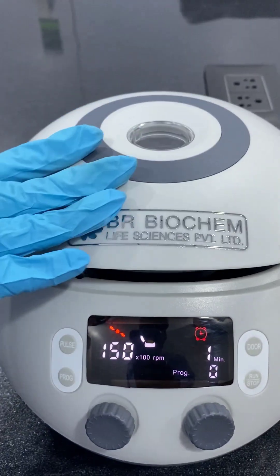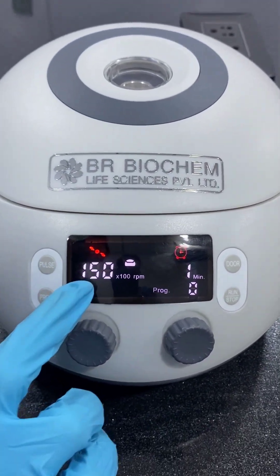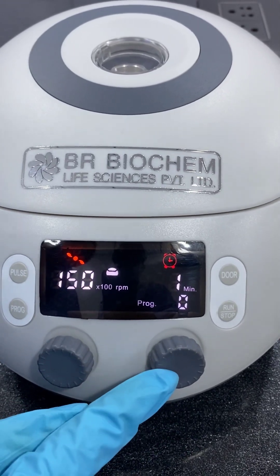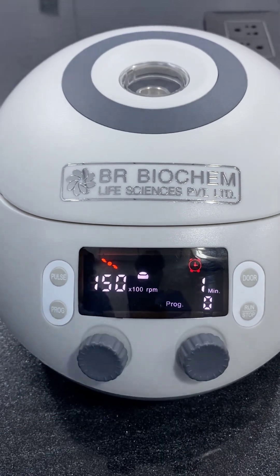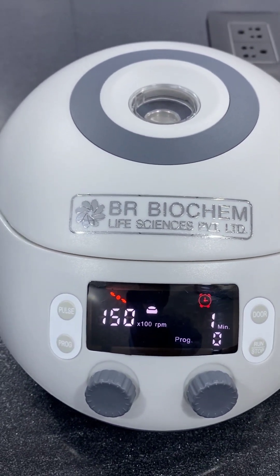Then close the lid and set the RPM. RPM can be set by moving this knob, and you can set the time range by moving this knob as well. The time range you can set in this machine is from 30 seconds to 99 minutes.